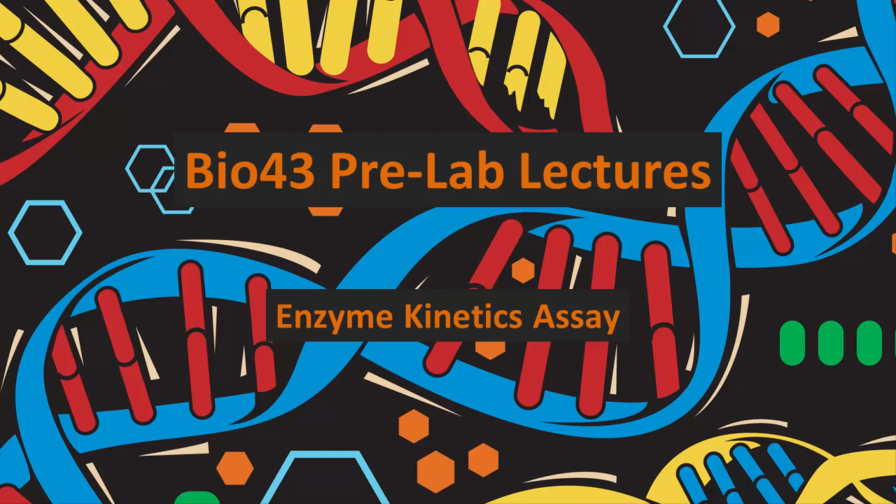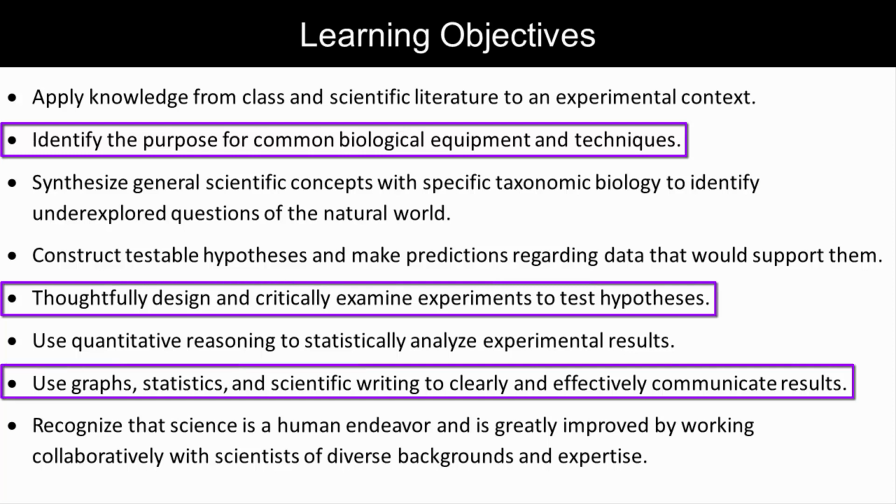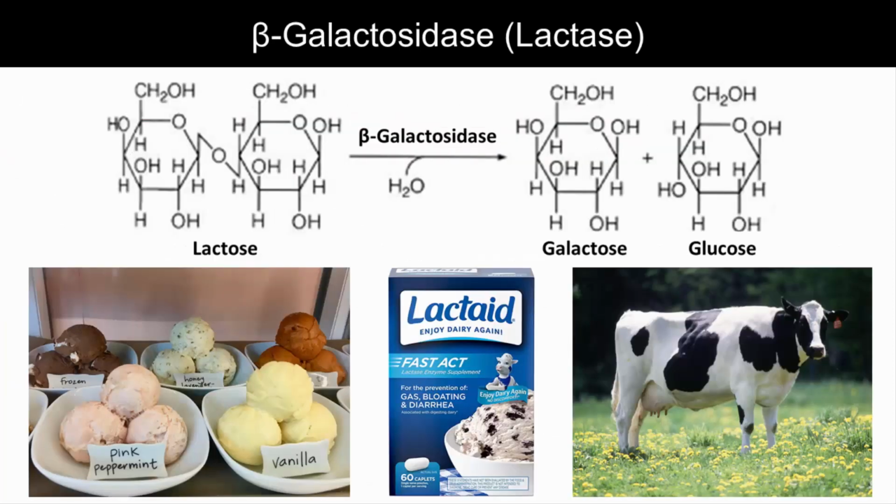Hello and welcome to this Bio43 pre-lab video. Today we're going to look at a basic enzyme kinetics assay. The focus of this unit will be on the enzyme beta-galactosidase, or lactase.